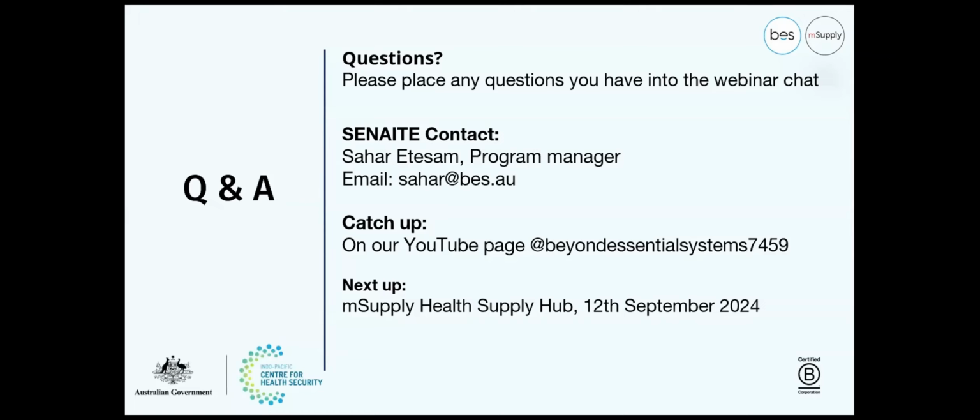Hi, Safia. Hi, sorry, it's Navin here. Thank you for the fantastic presentation. It's great to see many of our laboratory professionals working on SENAITE and Tamanu. Just wanted to ask whether you had a set list or template of data extraction from SENAITE. This is like monitoring turnaround times, managing workload and workload statistics, and other quality indicators like error rates, sample rejection, etc. If you could please elaborate on that, or if there's something that has to be built based on the request of the country, what quality indicators and data extraction they need out of SENAITE would be helpful. Thank you.